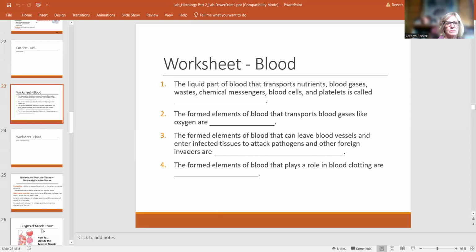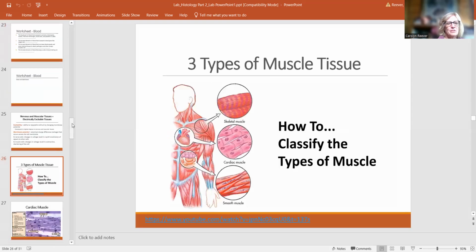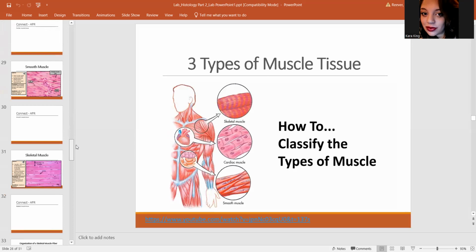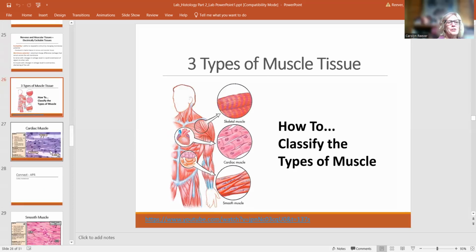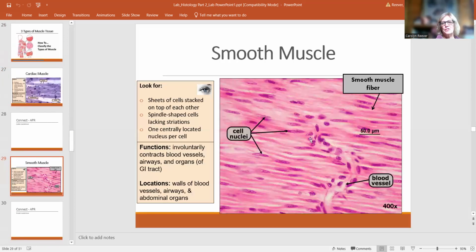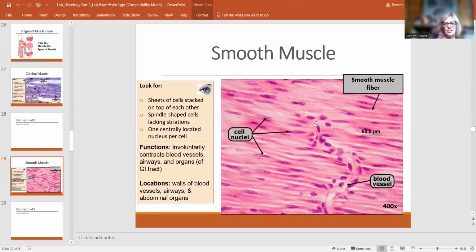Okay, let's go to muscle. I think the muscles are cool. Muscle is far more complex, I think, than the other ones, maybe. Well, it's harder. I like that she has this broken up into two sections because if she just showed a slide of this and you couldn't see the name, I get that and regular connective tissue confused because they're both kind of compacted.